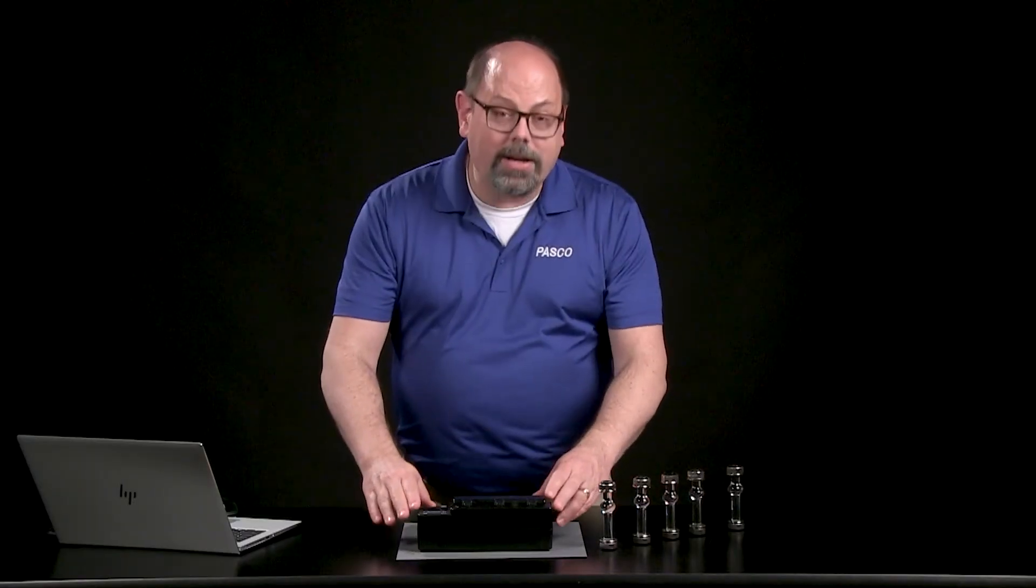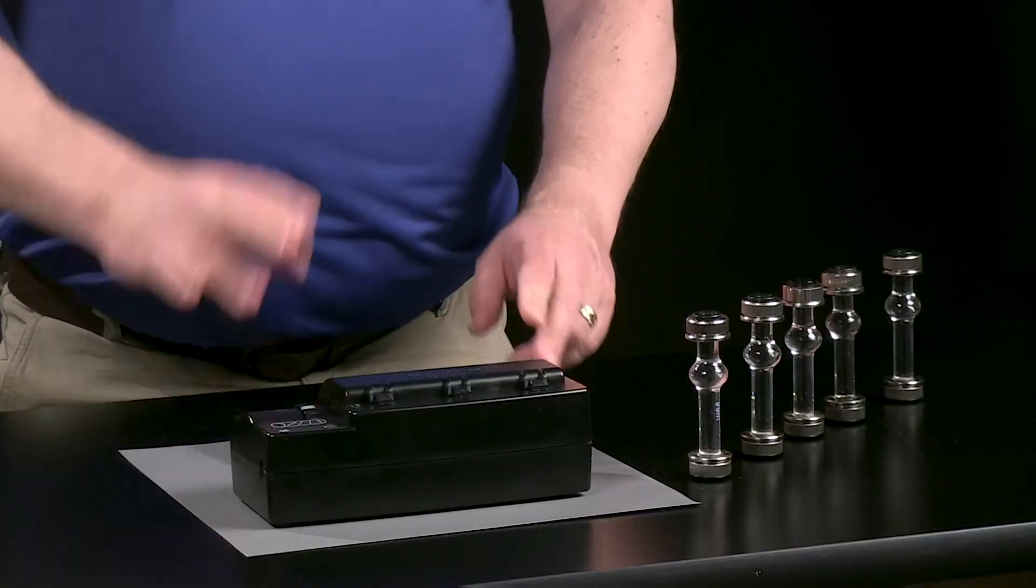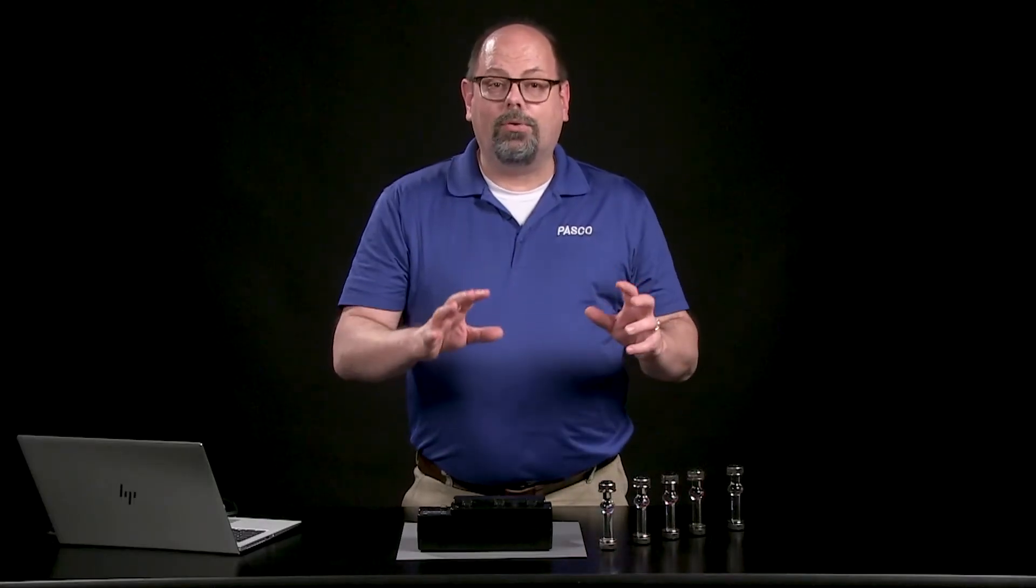Welcome, and I want to introduce to you the techniques that you can use with a polarimeter to determine concentrations of chiral molecules.